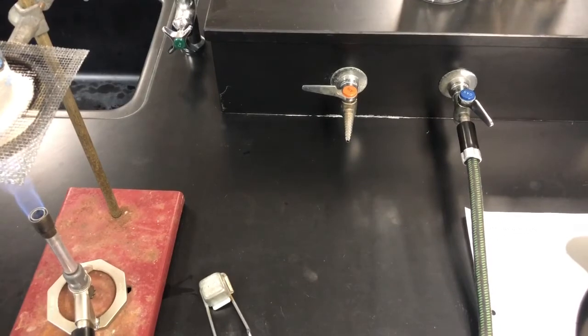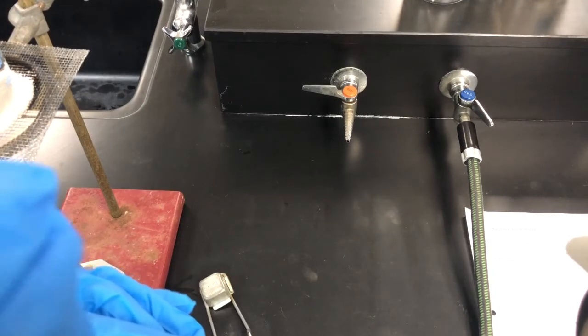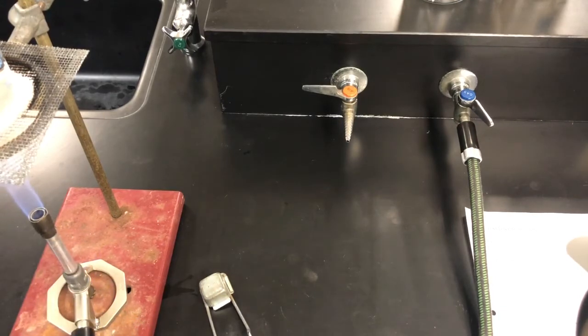Okay. Now we're going to repeat the same thing. So we're still using unknown number 24. We're going to take a squirt of that and put it in our test tube. And then we're going to take 3 drops of sodium hydroxide and put it down, making sure that it doesn't touch the sides the best that we can. So it says do 3 drops. So we're going to stick it down there. 1, 2, 3. Okay. And we're going to put it in our boiling water bath.